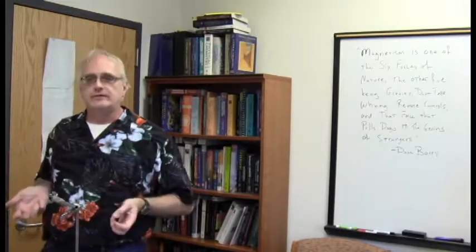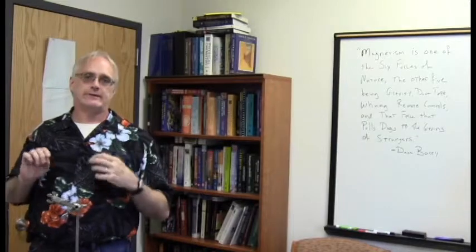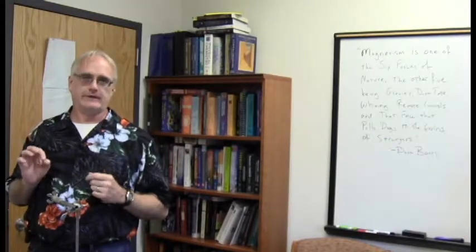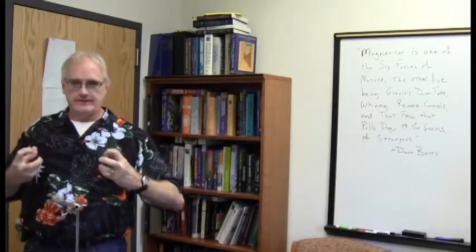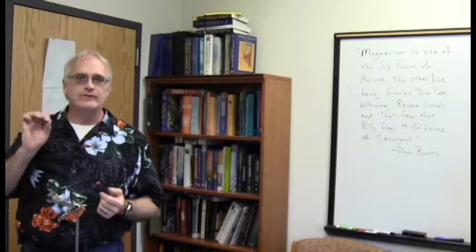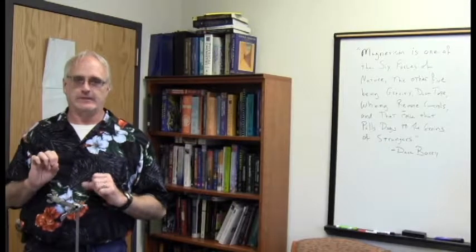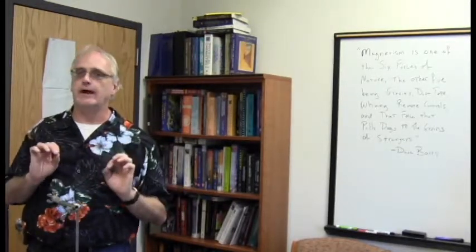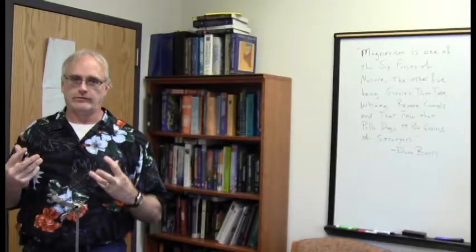Now, you've seen the probe here capture the sound waves, but now I want to introduce you to one other aspect of this: how to get out of these sound waves, particularly the complex sound waves, what are the frequencies of sound in those sound waves? That is what a Fourier transform does. I'm going to show that to you, introduce you to the equation, and then show you how it works.